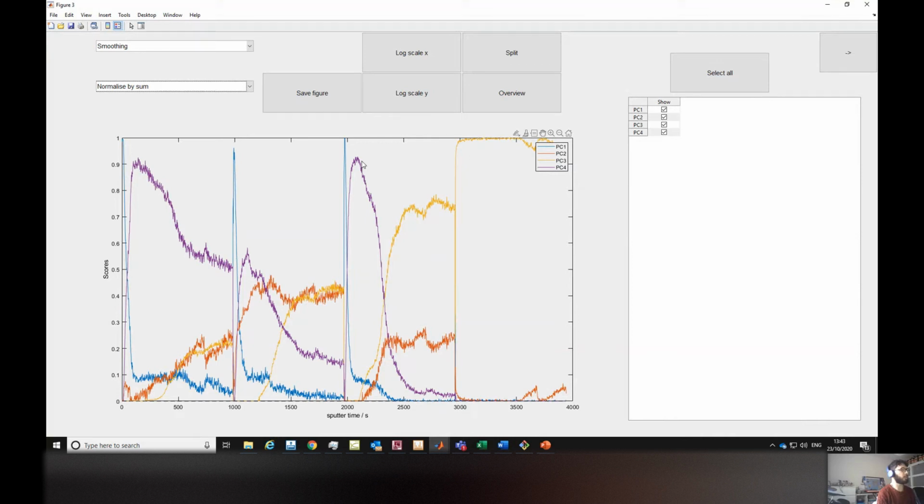Like it could have been that we stopped here, so we're not sure if we're hitting the substrate. So this is a very quick way to get all the ions related to the substrate, because you have one of the ROIs as your substrate. So the other 3 are different parts of the worm, right? So the interpretation is tricky.